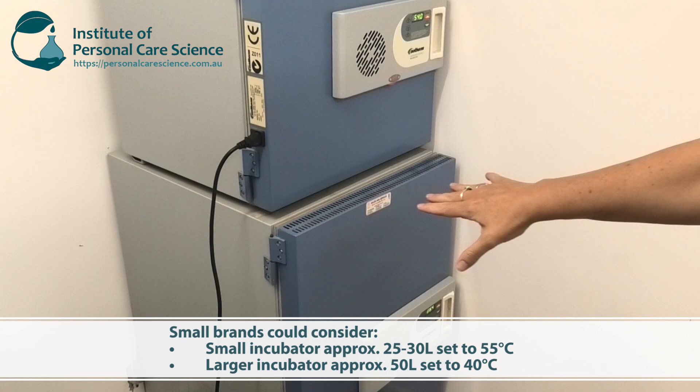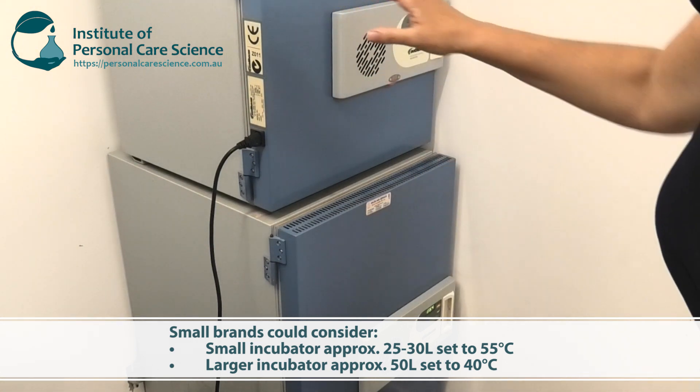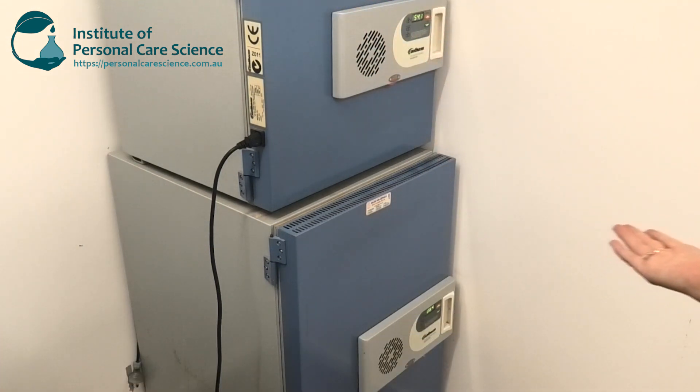So it's an accelerated stability testing chamber. If you're a small brand, you could get one incubator set to 40 degrees in that bar fridge size and one set to 55 degrees the size of a microwave. You'll find there's still plenty of storage space for those size incubators for small brands, and they're also very economical. Let me show you just how much space there is inside these two incubators.